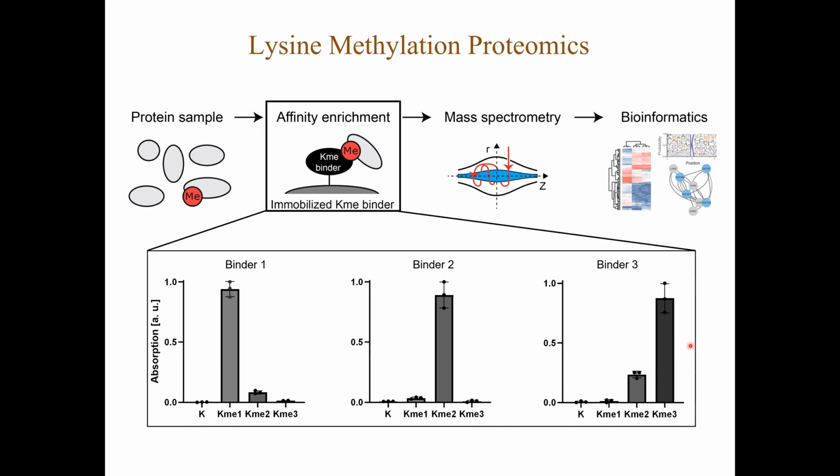And we are now working on functionalizing magnetic beads from Resyn Biosciences with these different antibodies to enrich lysine methylated peptides in a robust, reproducible and automated way for proteomic studies. And this is something we are also really excited about developing moving forward.